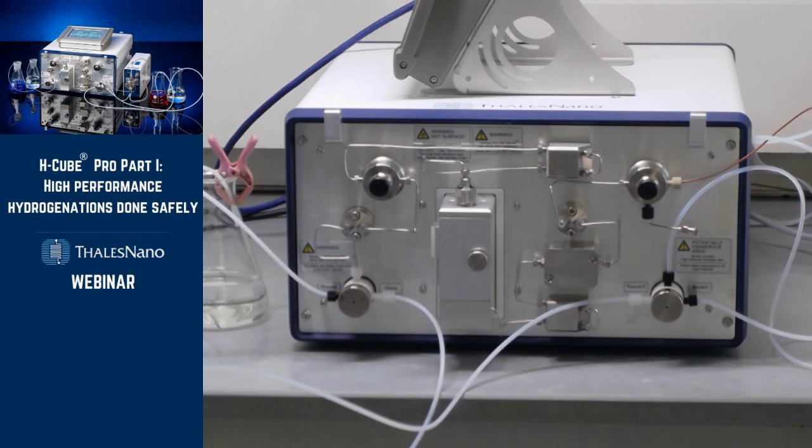Is any alert provided by the instrument if by any means the hydrogen pressure increases suddenly due to instrument error? The hydrogen pressure cannot increase suddenly above safe levels.